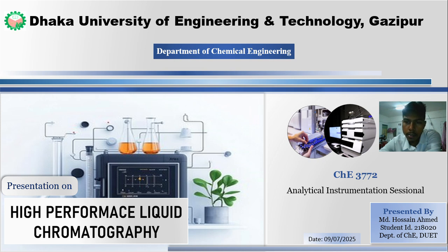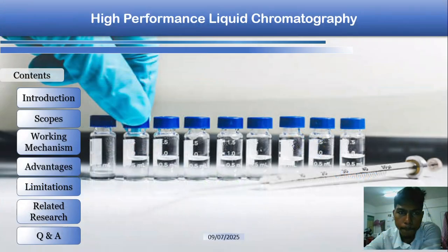Currently pursuing a Bachelor of Science in Chemical Engineering from Dhaka University of Engineering and Technology, Gazipur. I'd like to talk to you today about the most important, most prominent analytical technique, high performance liquid chromatography, HPLC. Let's move on and discuss. I'll be briefly discussing these contents throughout the presentation.